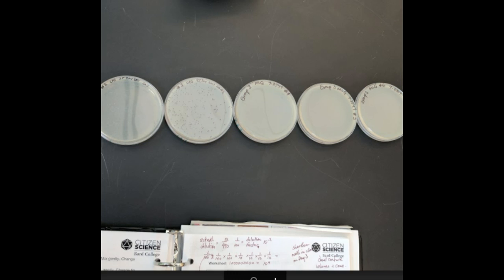After the plates solidify, invert and place them in the incubator. Incubate them overnight.